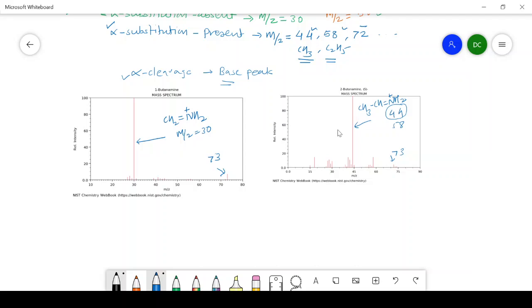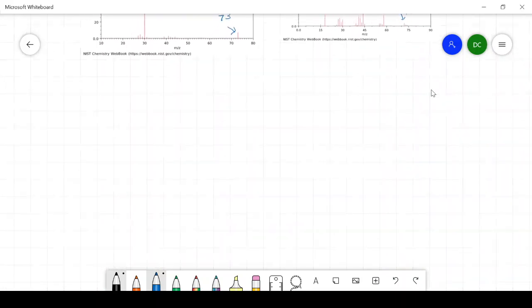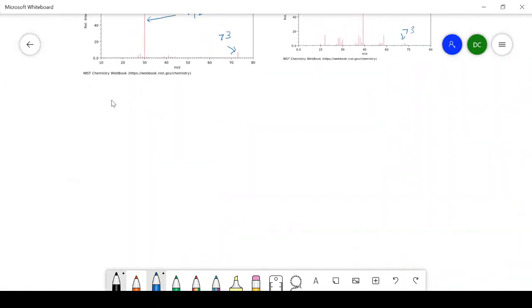Though the molecular formula of the compounds and the m/z values of the molecular ion are the same, there is a difference between the m/z values of the iminium ions. Now we will turn towards fragmentation in the case of secondary amines. As an example of a secondary amine I will take here diethylamine.